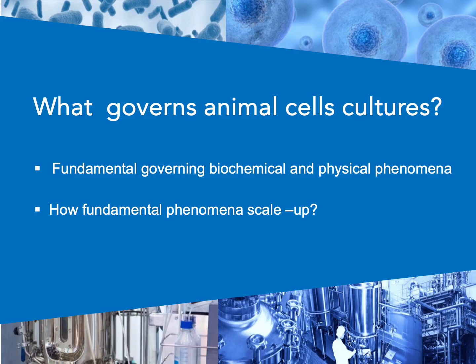In this tutorial, we will address two key questions. What are the fundamental biochemical and physical phenomena that govern cell culture dynamics in bioreactors? How do these fundamental phenomena change during scale-up?